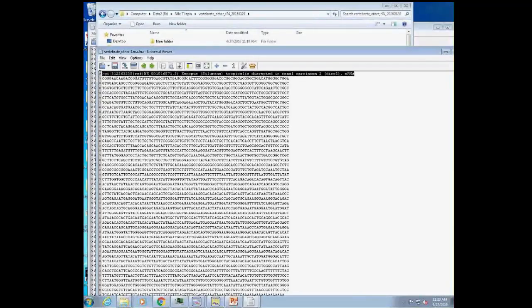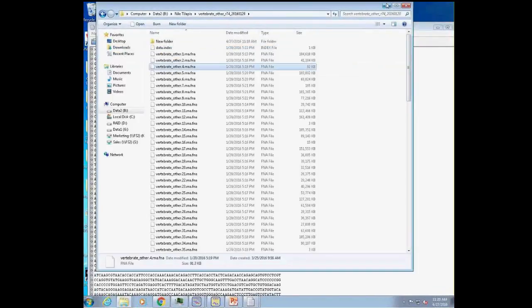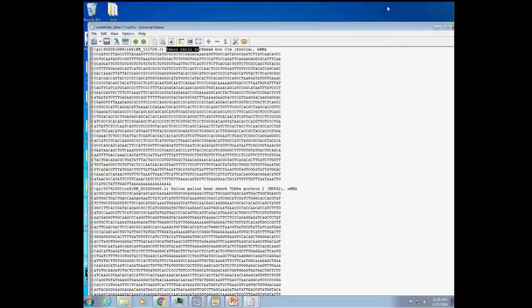So what I'm going to show you with the RNA-Seq is how we actually use this information to enrich our RNA-Seq analysis, where it's really useful to know the organism, and the description of the genes from our de novo assembled contigs. So that's where we connect the de novo workflow with the RNA-Seq. Okay, so let's go to the RNA-Seq. Again, if you didn't participate in the webinar on de novo transcriptome, it's recorded and on our website. I encourage you to watch that webinar, and then this webinar is part 2 of that same workflow.